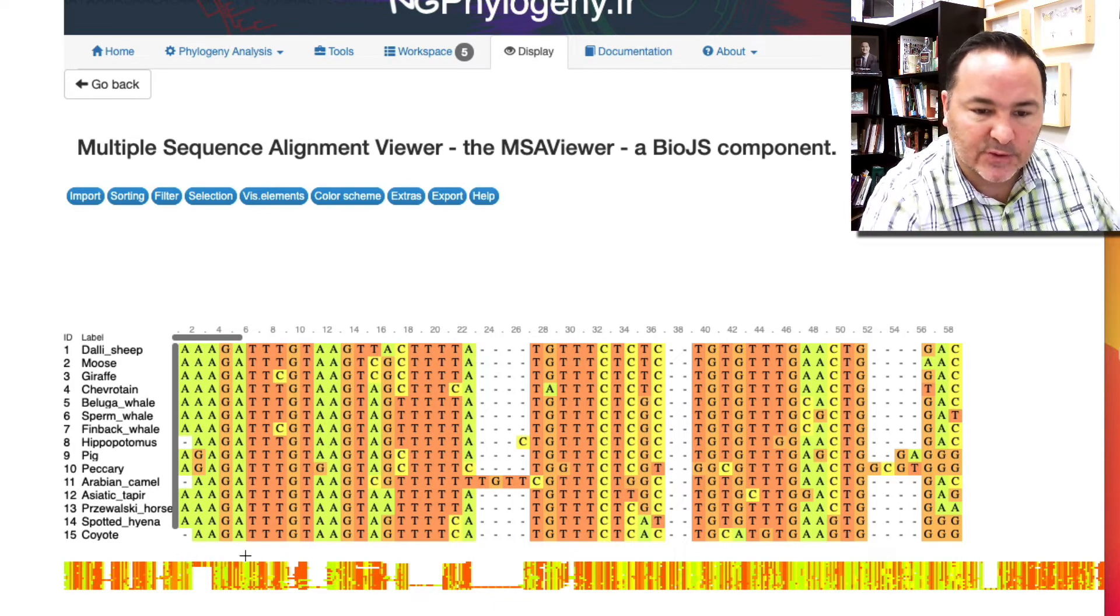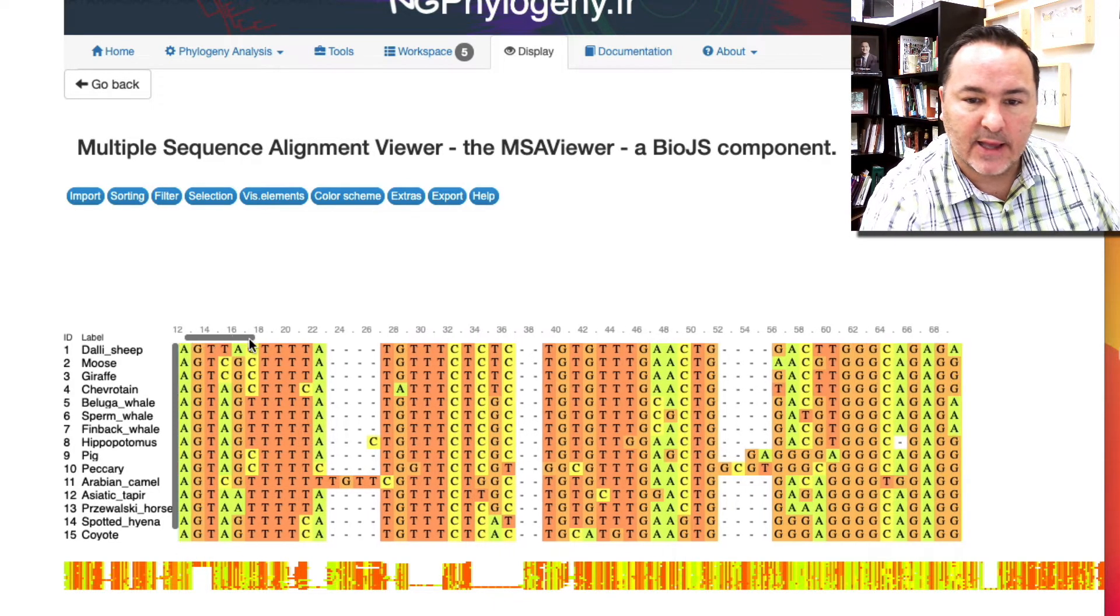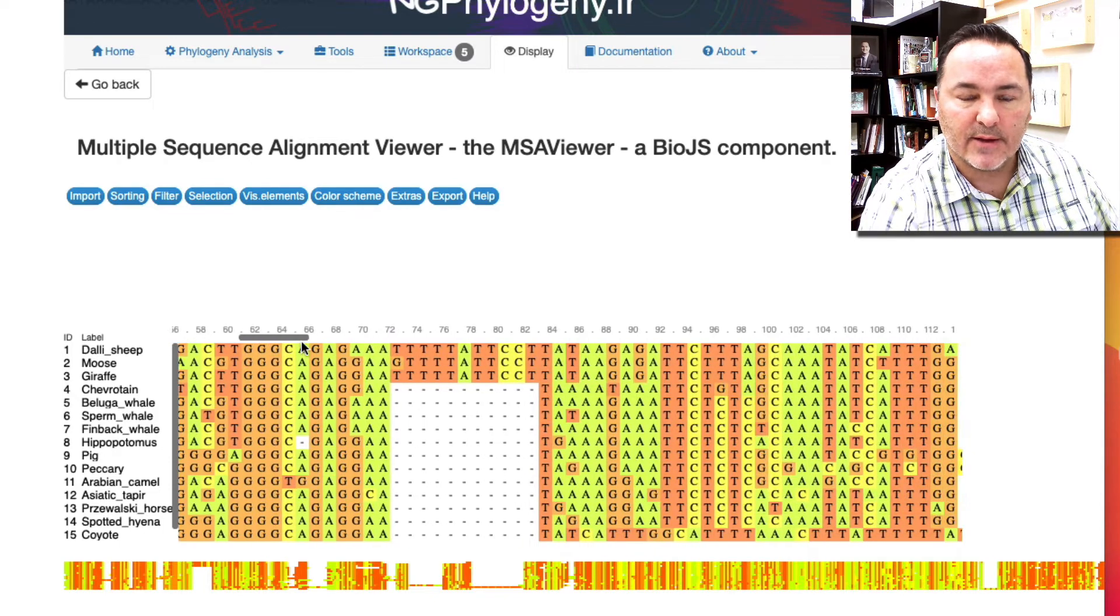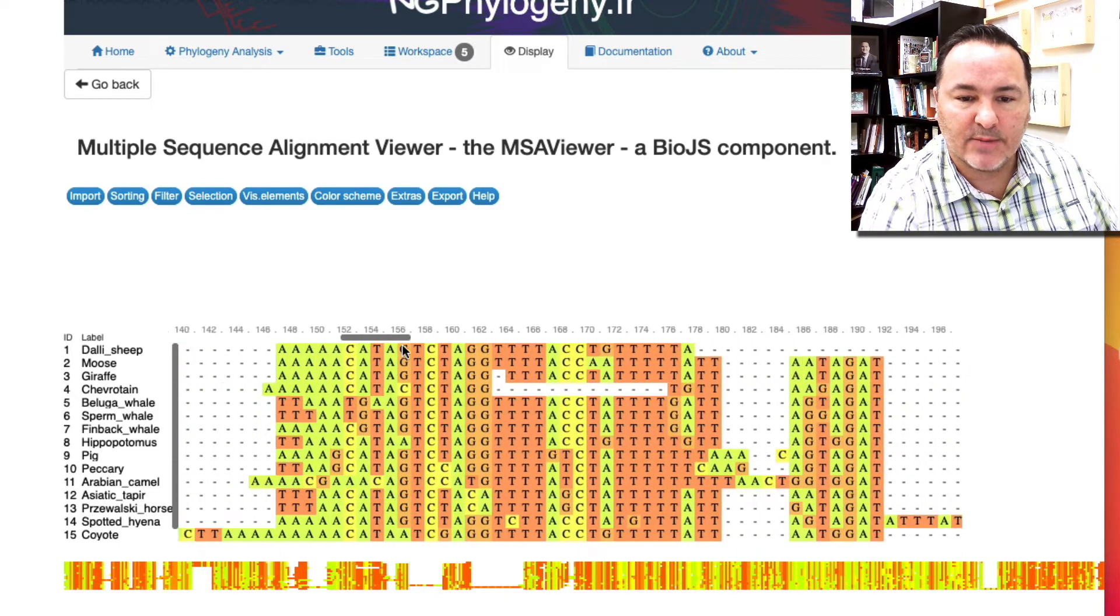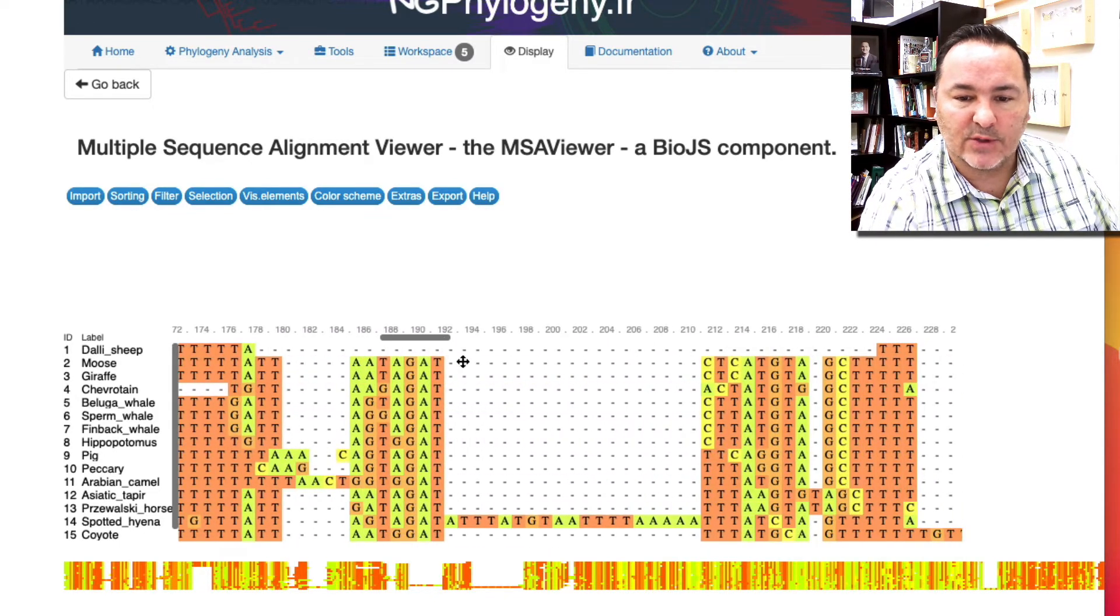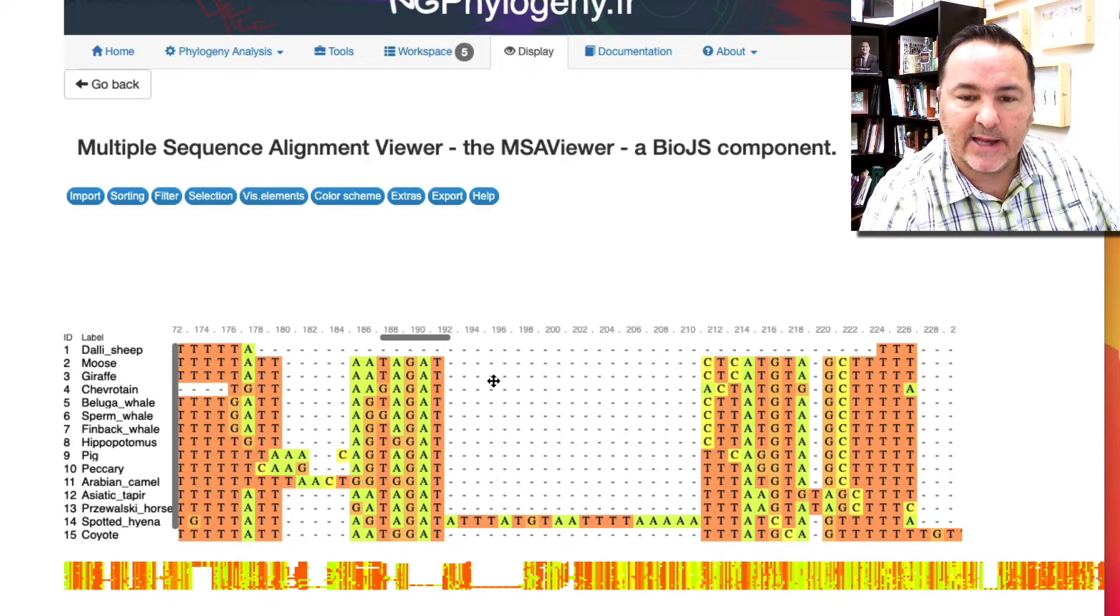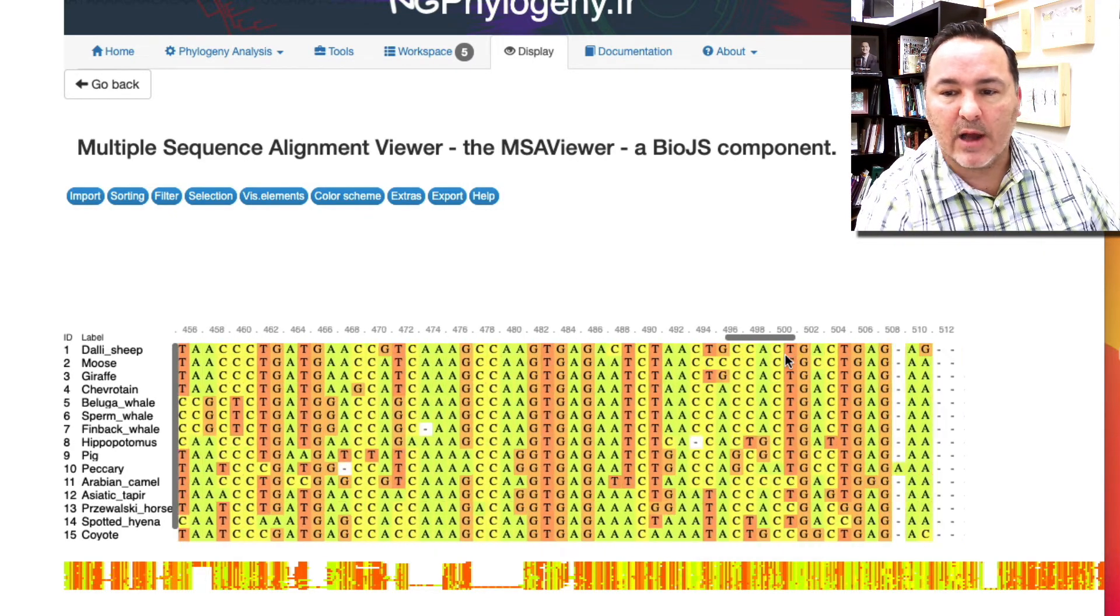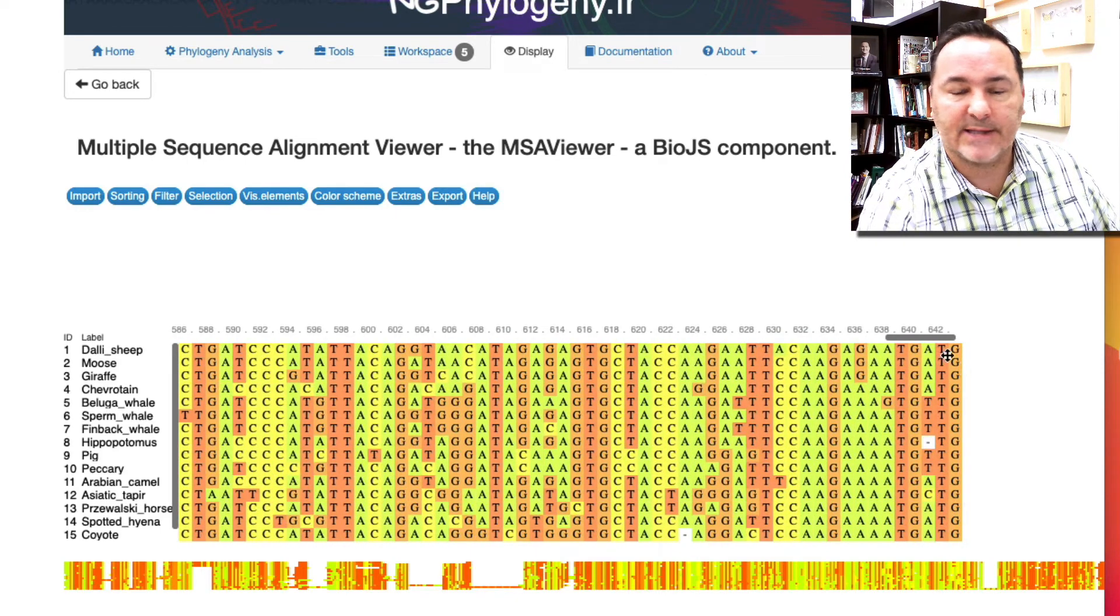We can see that again as we scroll through here. Some of them have data there, some don't. Sometimes you have where it's only one organism has data and nothing else does, but at least it's aligned all the way down the data set.